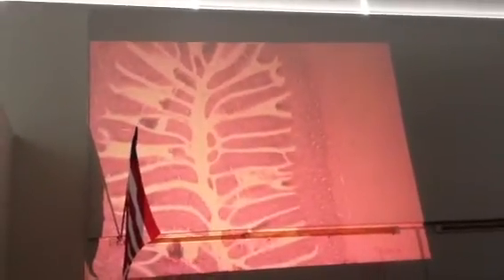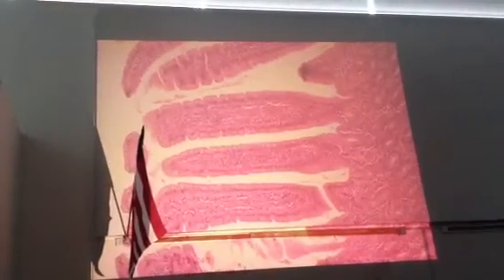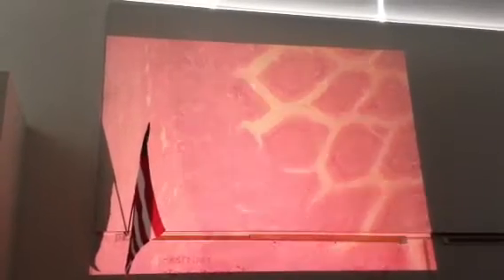So let's watch. Here's the submucosa, and let's watch as we go around. I can go to higher power, and you can see there's no glands there, and the Brunner's glands that we see in the duodenum are everywhere. You don't have to look very far for them. So there are no glands present here, and clearly no Peyer's patches. So I've gone down one side, coming up the other. So that says I'm in jejunum.